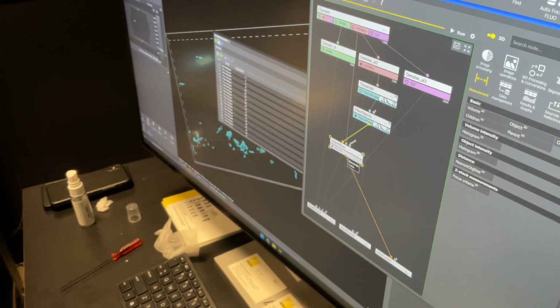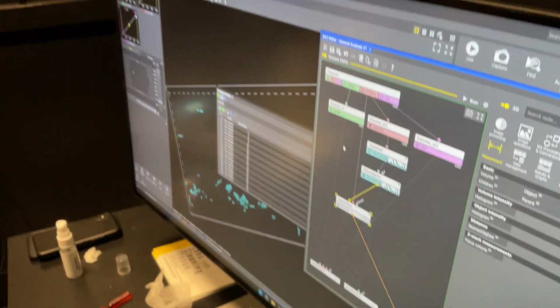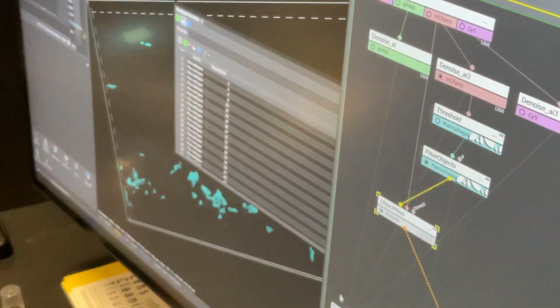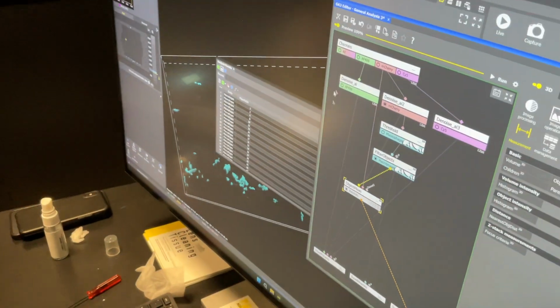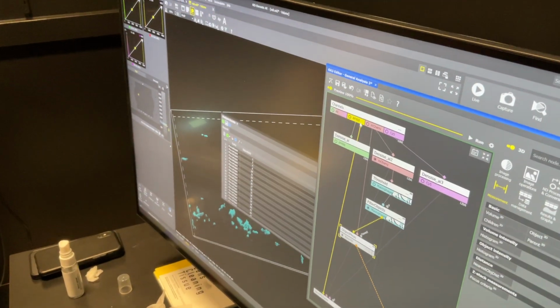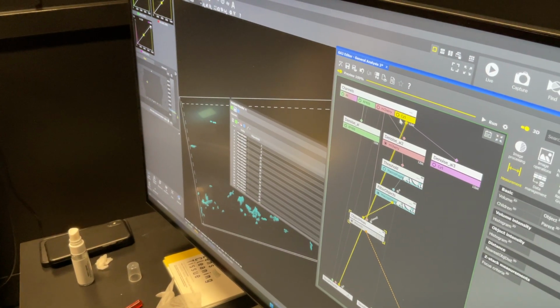That's nice. And in the end, if we look right here, our saved pictures, you see they're outputting to... Well, right now, those are linked to my denoised. Well, I don't want that. I'm just going to take these, and I'm going to relink them to my raw data.